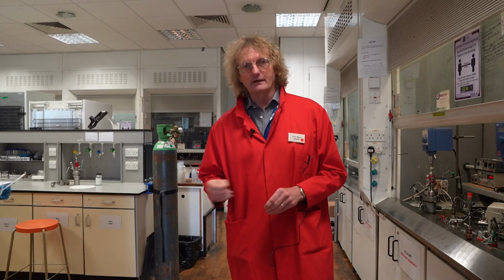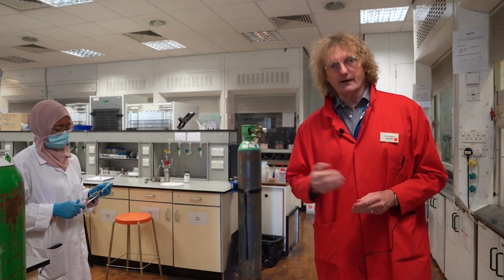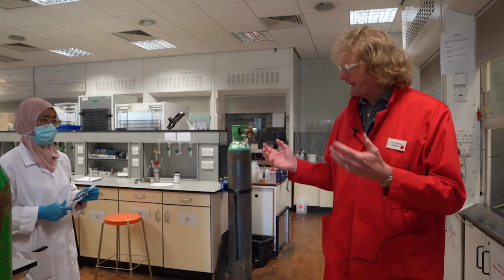Okay, so what we're going to do today is we're going to show you one of our reactions, and one of my colleagues, a PhD researcher, Cartini Alias, is going to take us through the synthesis of some polymethyl methacrylate using dispersion polymerization in supercritical CO2, and she's going to take you through all the steps, and so I'm going to hand over to Cartini now.